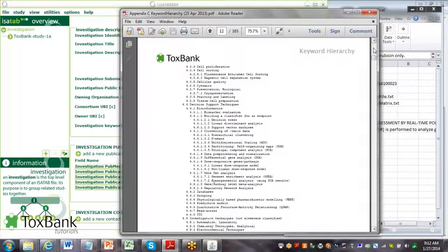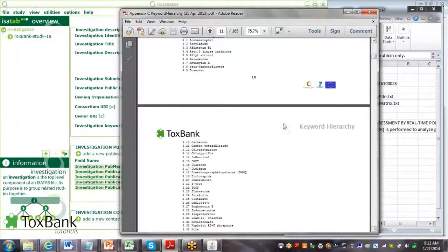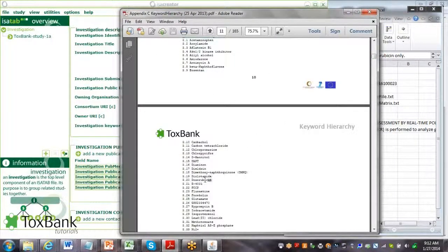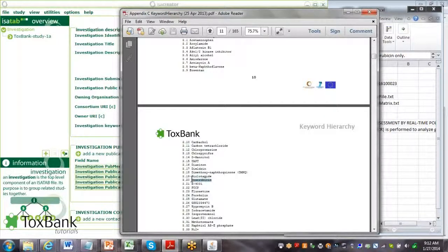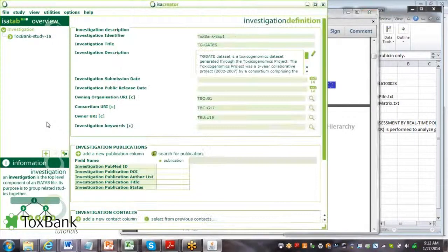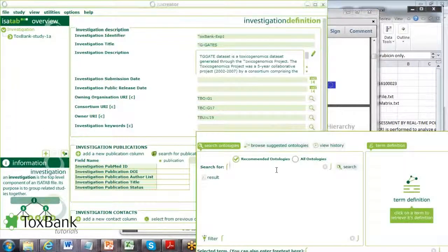For example, if we wanted to add doxorubicin, I'm just going to copy doxorubicin here and do a search for the keyword.